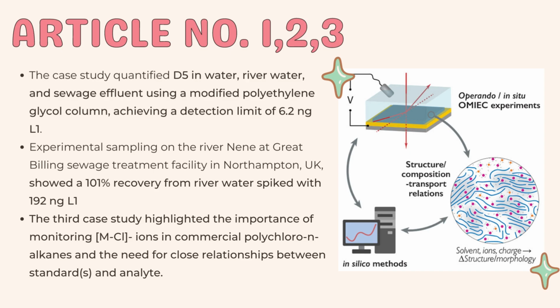Experimental sampling on the River Nene at Great Billing Sewage Treatment Facility in Northampton, UK showed a 101% recovery from river water spiked with 192 ng/L. The study also investigated potential sewage effluent contamination with 5 target drugs from 1998 until 1999.